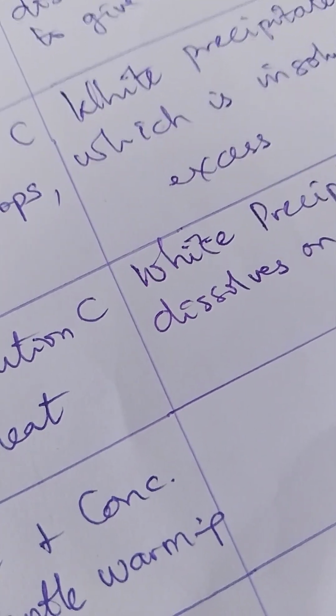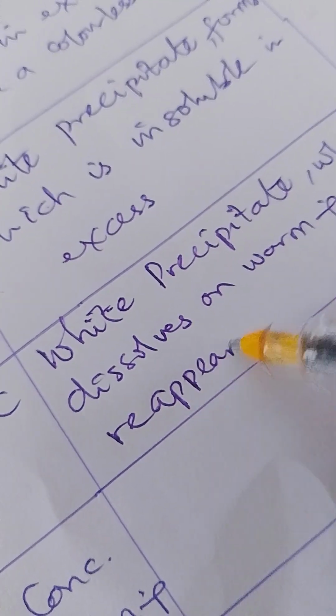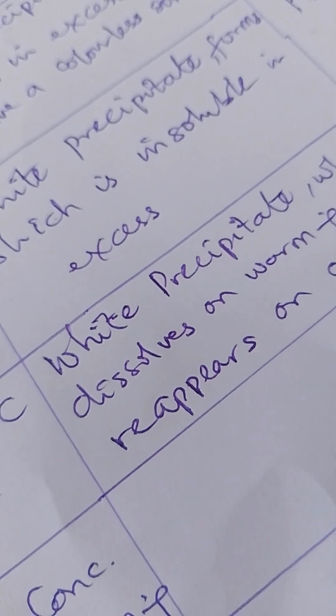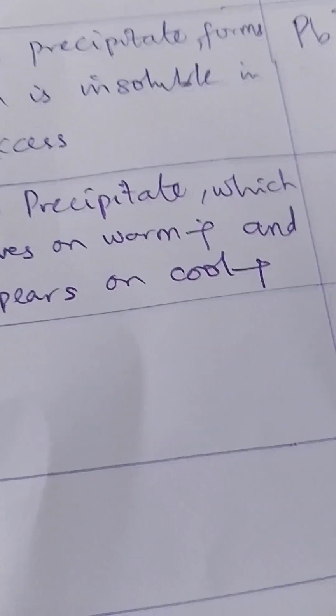And you now notice after it dissolves, when it's allowed to cool a little bit, it will reappear. So we say which reappears on cooling. All these facts must be stated, which reappears on cooling. And with this observation, that confirms the presence of lead ion.